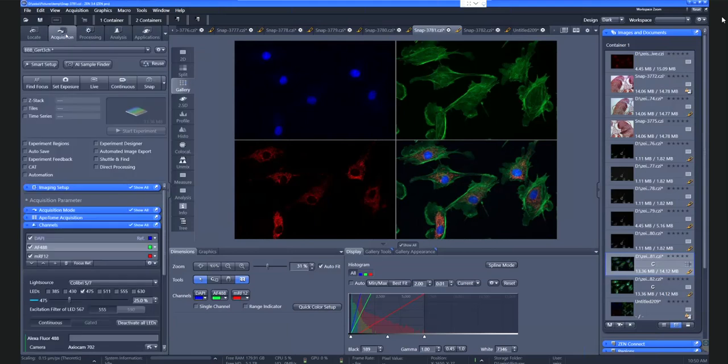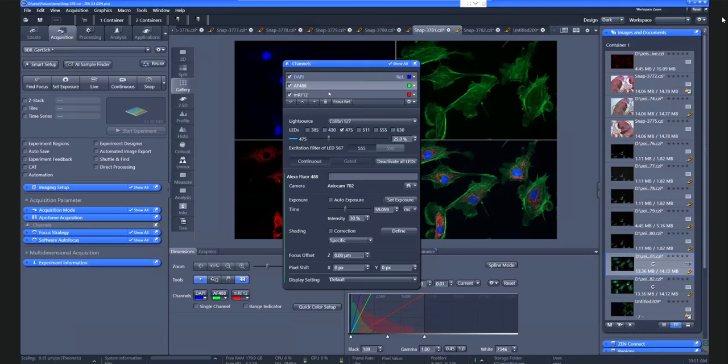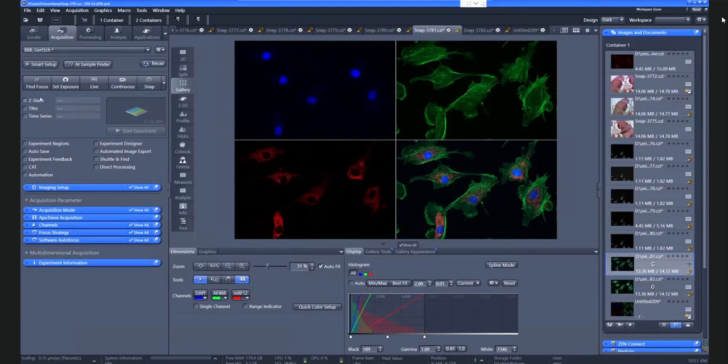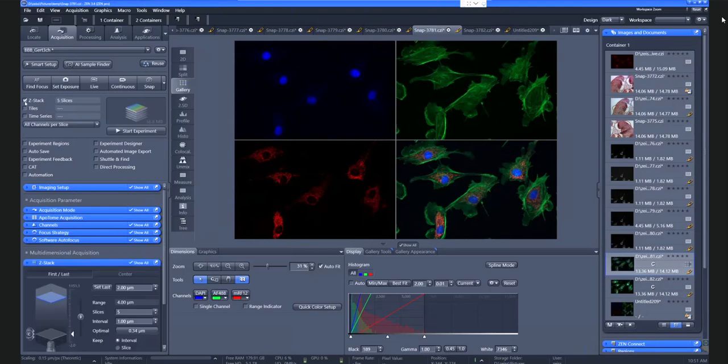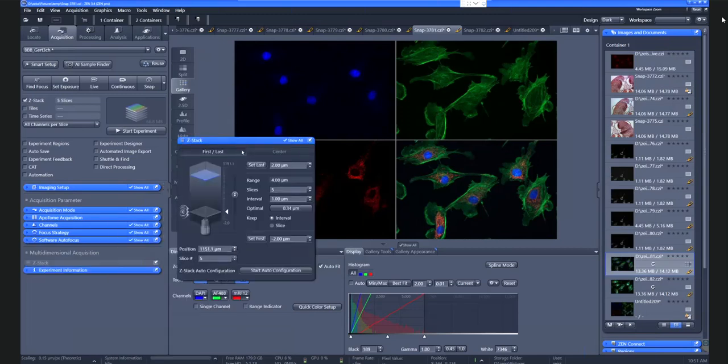As an outlook on what comes next, I will do one more thing. So always set the parameters for all the single channels first, and then you can feel free to check and pick one of the options showing up here, maybe a Z-stack. So what happens if we want to acquire a Z-stack? We get another option, another drop-down menu, which allows us to set the positions we want to acquire with this Z-stack.